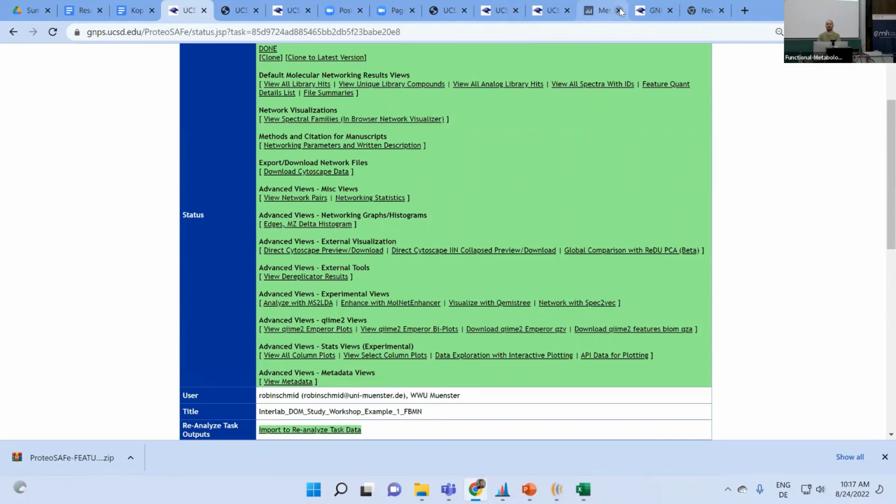Exactly. Yeah. So that is what we take out of it as the main take home, right? I want to get network connectivity between my features of my feature table and annotation. And that's at the end all we take, and we move on from there, and then we add SIRIUS and MS2LDA on top, right? And then what we need is just the feature number as our anchor that connects that. And that is given from your output table from MZmine yesterday.